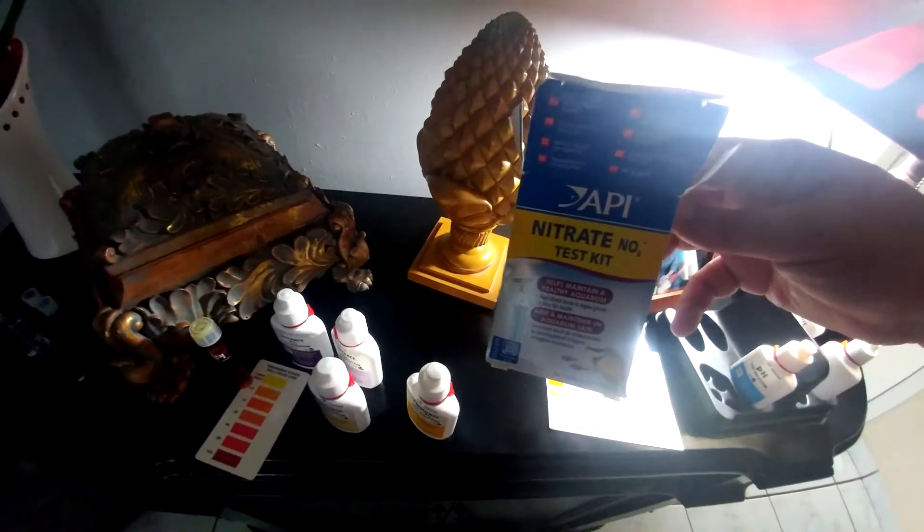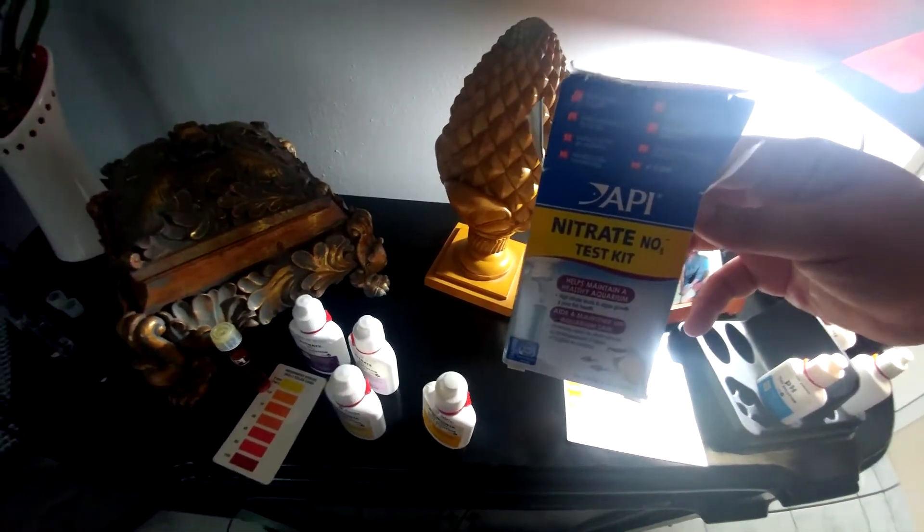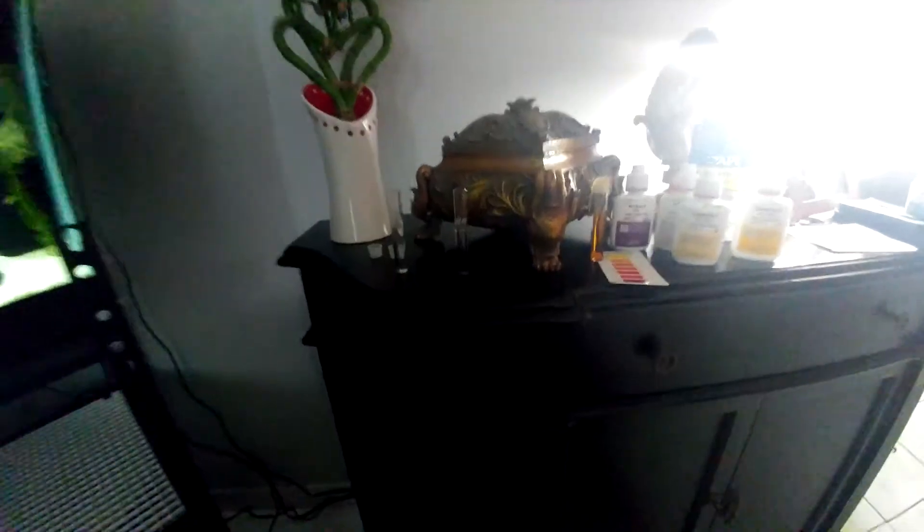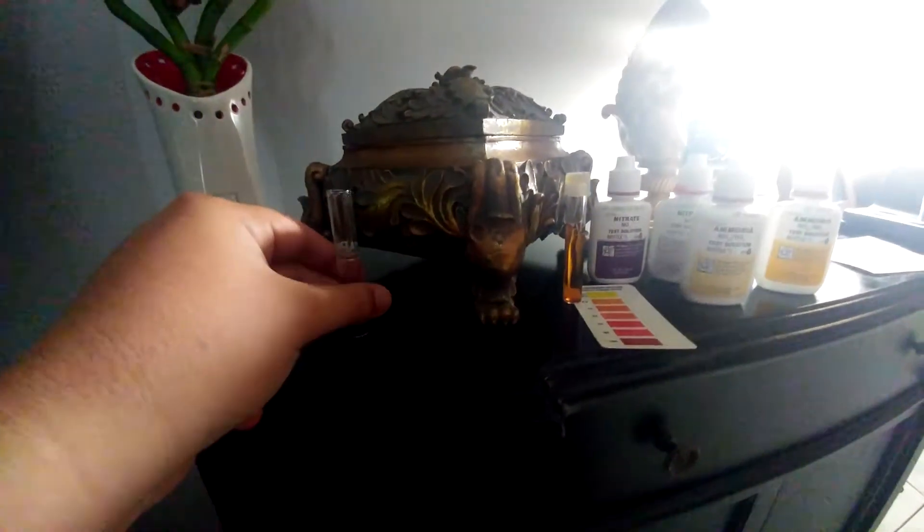When you're testing, this is our master aquarium kit. I also have this little nitrate one because my nitrate one ran out — this is what I test for the most. The nitrate kit is very important to use correctly; I've seen a lot of videos where people are not testing it correctly, so I'm here to show you how to do it.